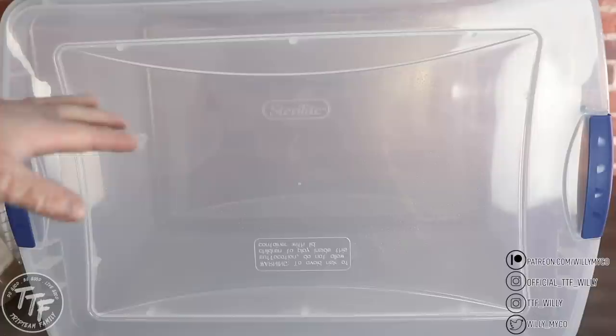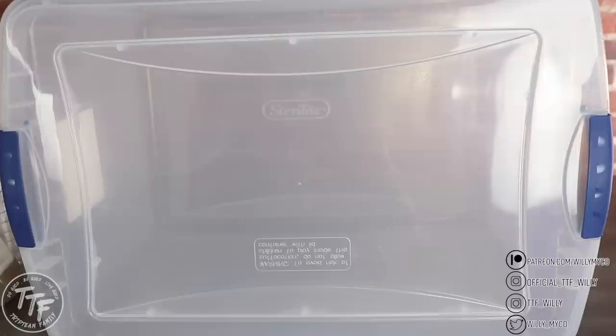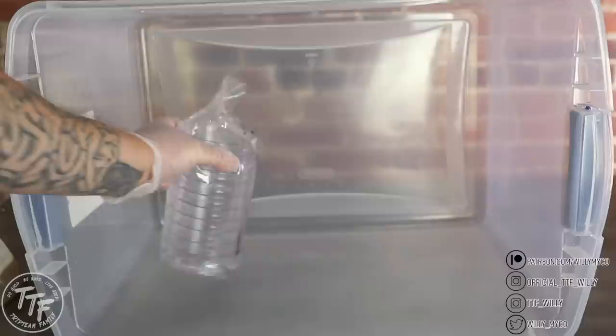After the air has settled for about 10 to 15 minutes, we're going to put our agar and petri dishes inside our clean space. Remove the lid and place it off to the side. Before you put anything in there — whether it's your agar or your petri dishes — you want to wipe it down really well with some isopropyl alcohol. We don't want to bring any contaminants into our clean space. We don't want to recontaminate it by bringing dust or debris that might be on the sleeve of the petri dishes or on our agar bottle or flask.